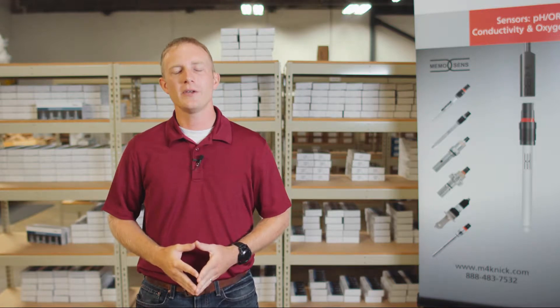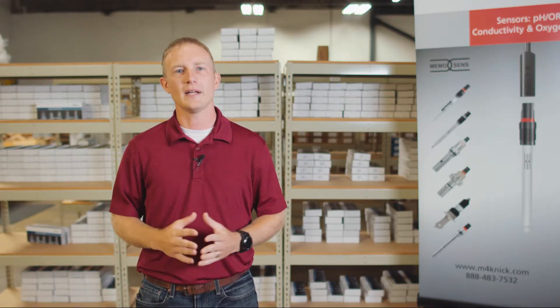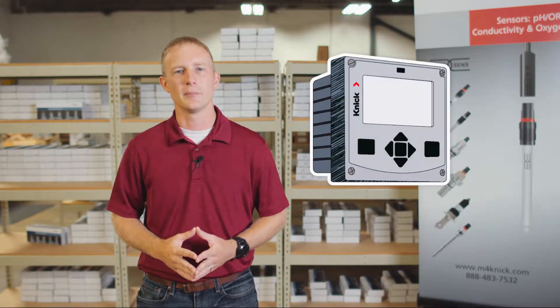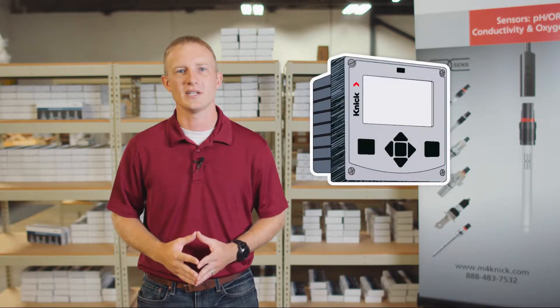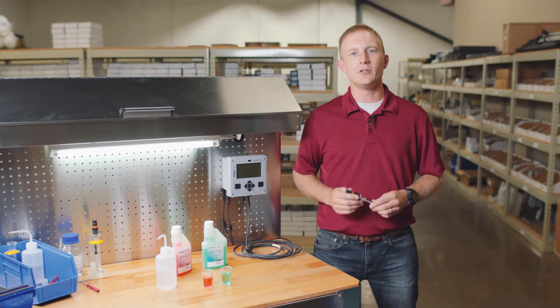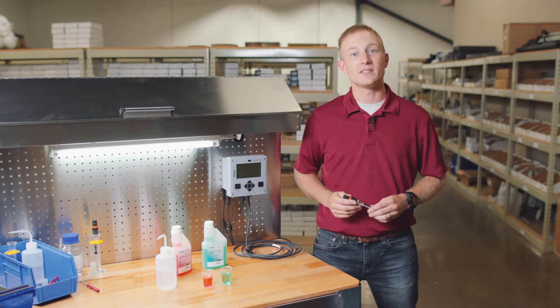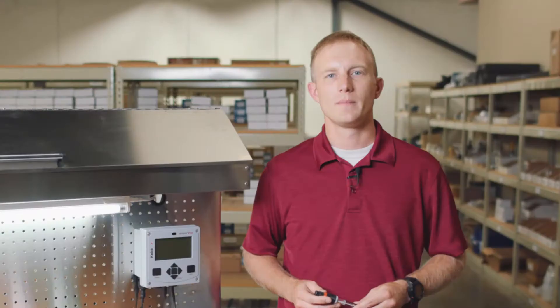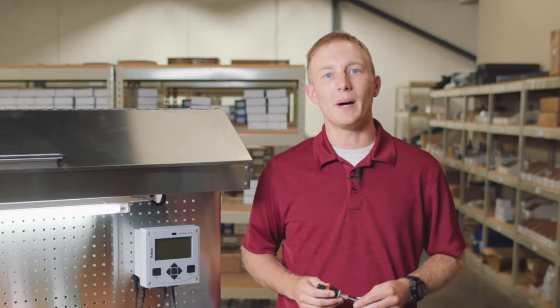This video will walk you through the steps to perform an automatic two-point pH calibration using the Stratasevo transmitter from Kinnick with the MemoSense pH sensor. The main benefit of using MemoSense digital sensors is that the calibration data is stored in the sensor head and not in the transmitter. This allows us to save time by pre-calibrating our sensors and storing them on the shelf.